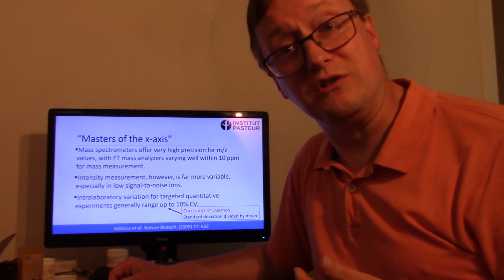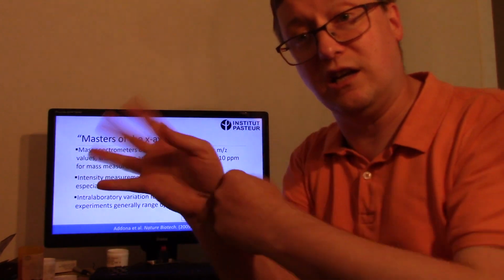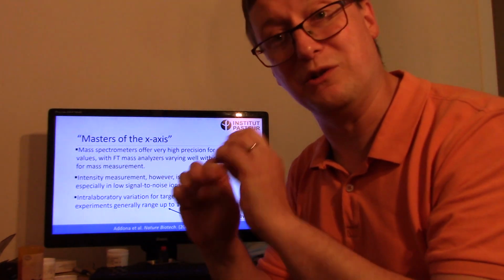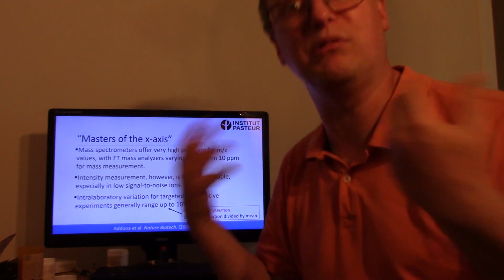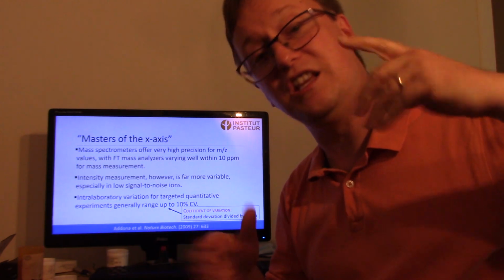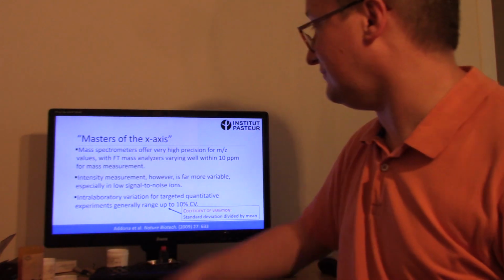We frequently make use of things like electron multipliers, where an ion coming in to hit the detector creates a spray of electrons that hits another set of electrodes that kick off another spray of electrons until you have enough amplification that you have a measurable signal. This creates quite a lot of variability in the intensity you might measure for multiple scans of the same thing.